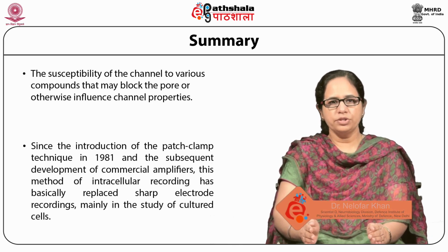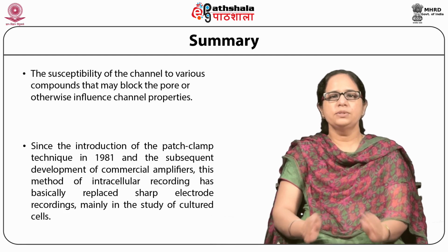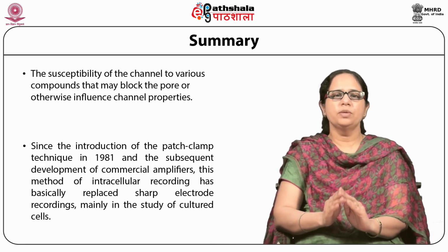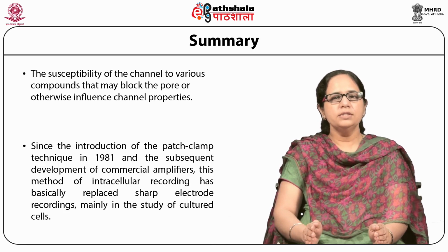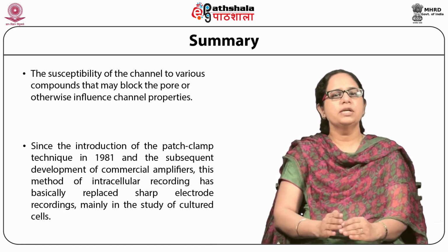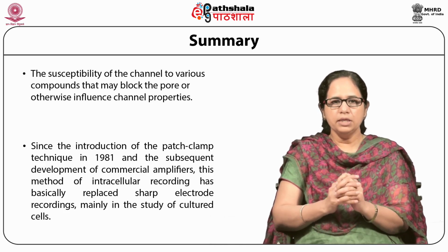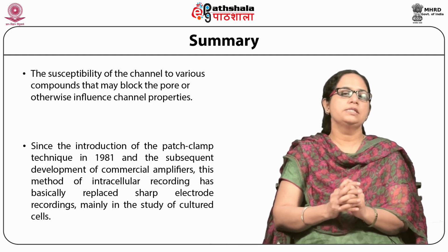Since the introduction of the patch clamp technique in 1981 and the subsequent development of the commercial amplifier, this method of intracellular recording has basically replaced sharp electrode recording, mainly in the study of cultured cells.